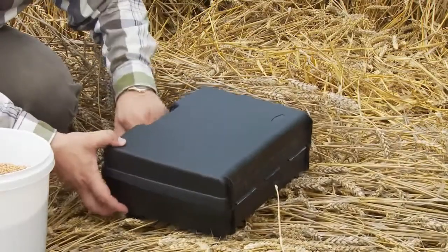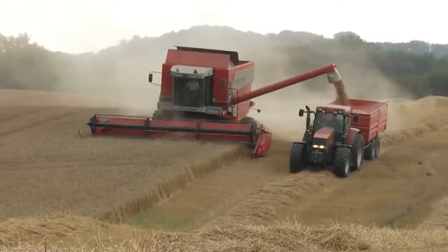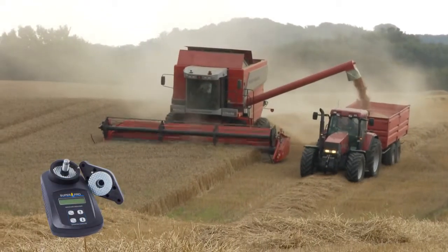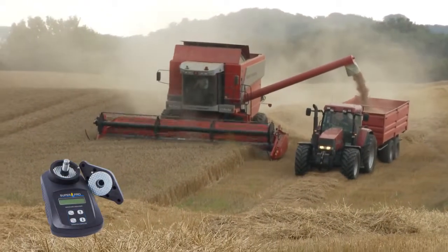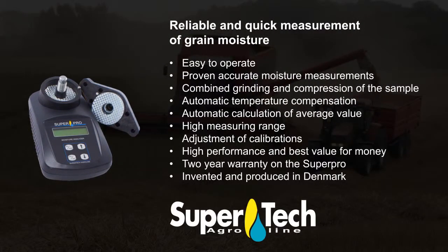SuperPro is delivered in a practical and hard carrying case, so you can take it with you wherever you need it. That gives you a portable and reliable companion in grain quality management. SuperTech High Quality Post Harvest Equipment.